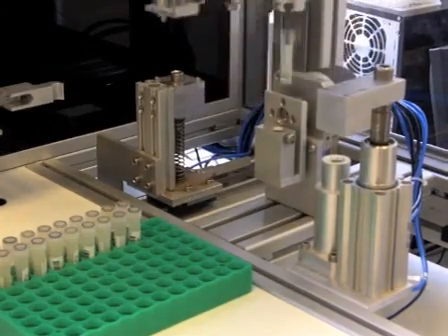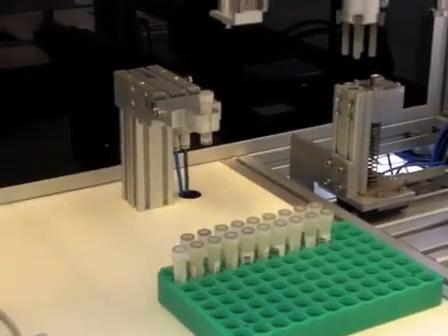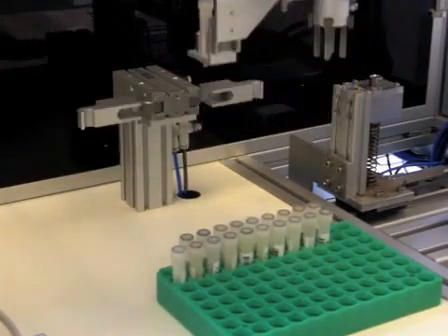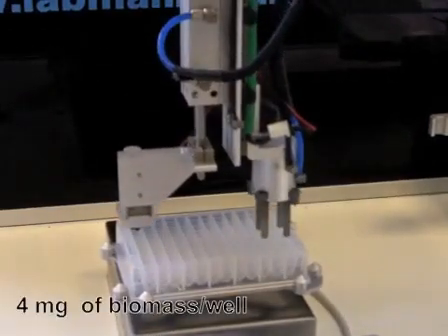Then the vial is repositioned in the robotic arm so that it is sitting within a funnel that vibrates to dispense the powder. The vibration of the funnel is regulated by a balance to achieve the target amount of biomass per well being dispensed.